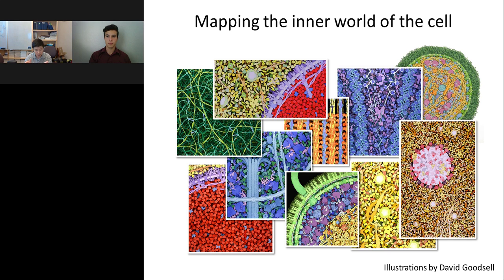But anyway, I think we always need to be careful when labeling protein with pretty much anything, not to perturb the target function. And I would say that GFP11 is likely the one that has less perturbation compared to fluorescent GFP, if they are not having the same amount of perturbation.